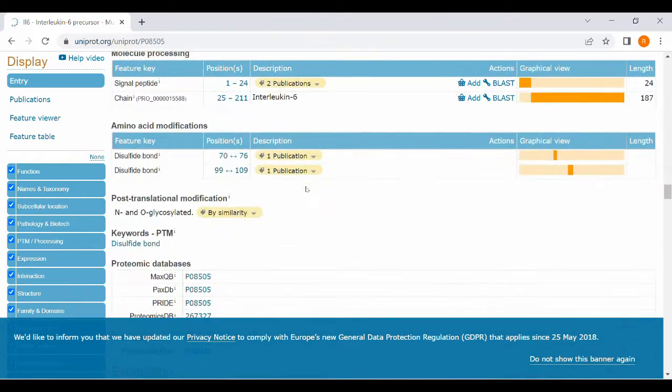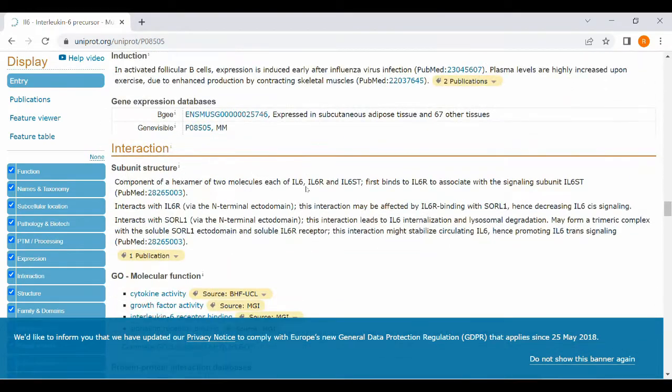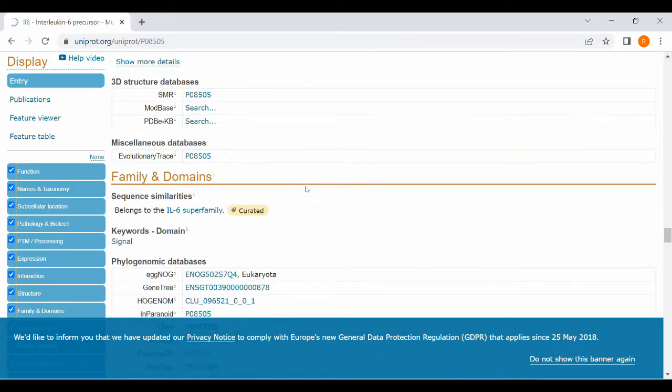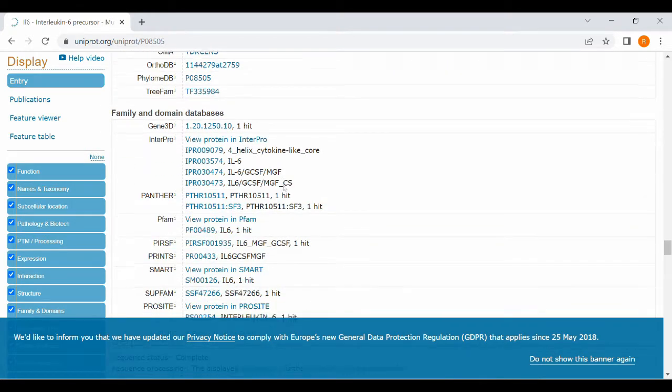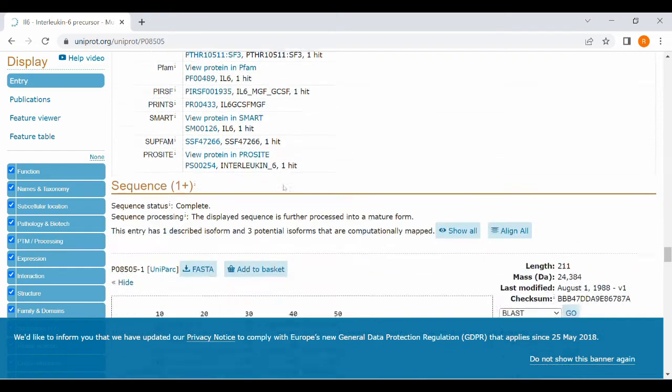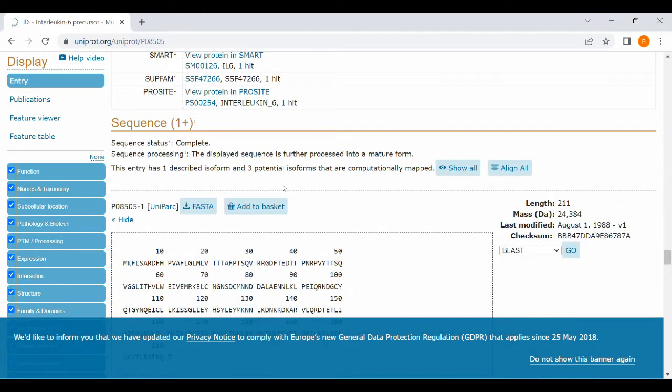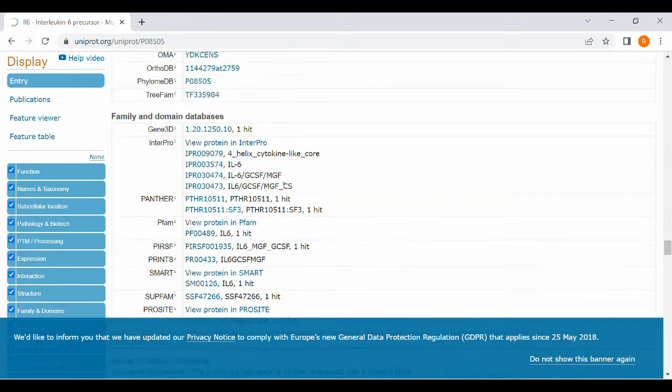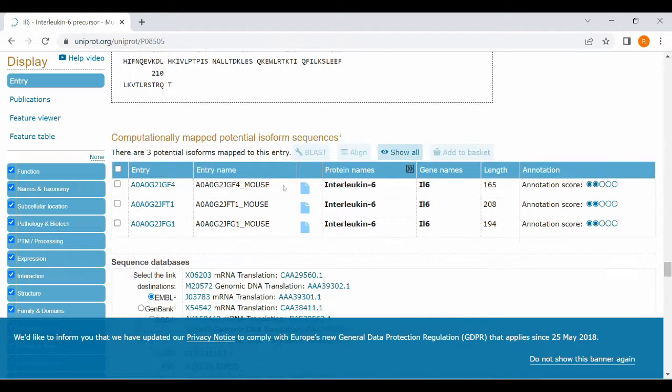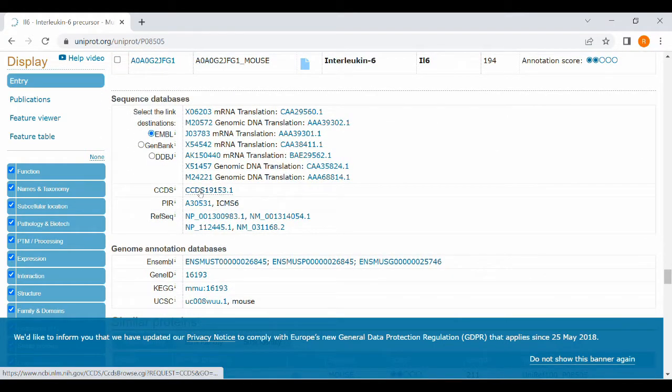CCDS sequence is a particular number inside the CCDS cDNA database. Look for CCDS number inside the web page. So scroll down. Here I found the CCDS sequence. Just click on CCDS sequence.